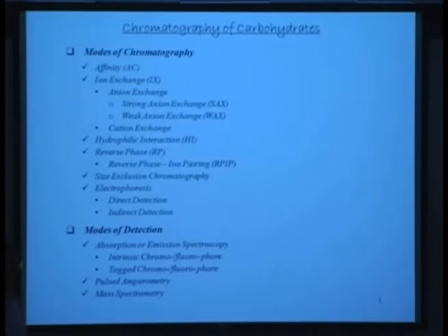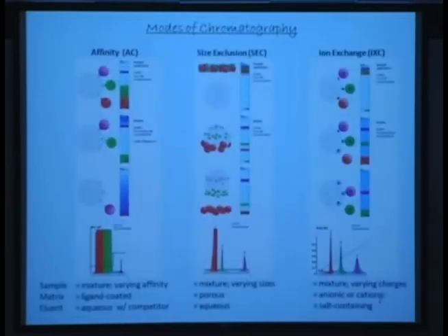So what I'm going to talk about primarily is liquid chromatography based carbohydrate resolution, detection, and identification, where MS forms a significant component. Okay. All right. So in the next hour or so, we are going to simply understand the principles of these techniques. I have a very succinct figure that I want you all to focus upon, to understand the different techniques at a very fundamental level, and hopefully you won't forget it.